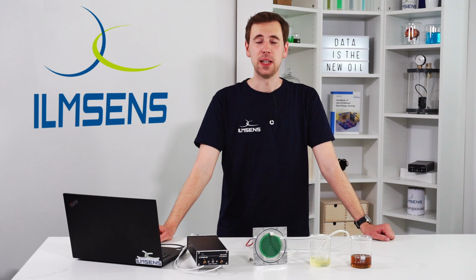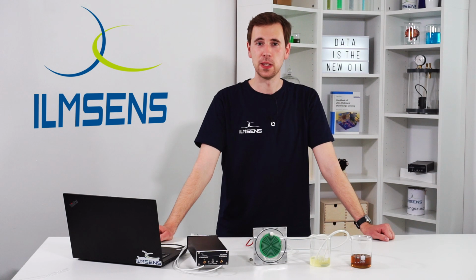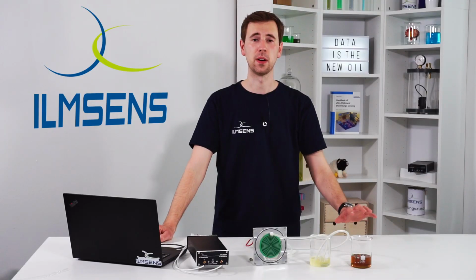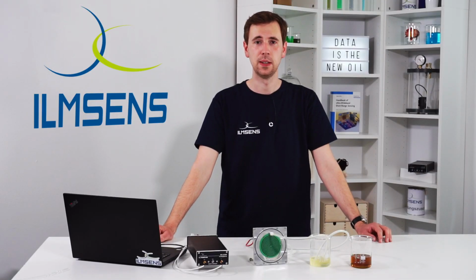The analysis of liquids can of course be transferred to other applications. For example, if you're having a multi-component system and you need to find out whether the mixing ratio is correct. Or if you get a new liquid and you need to find out about its additives. Or, for example, if you need to know about contaminations in your process.